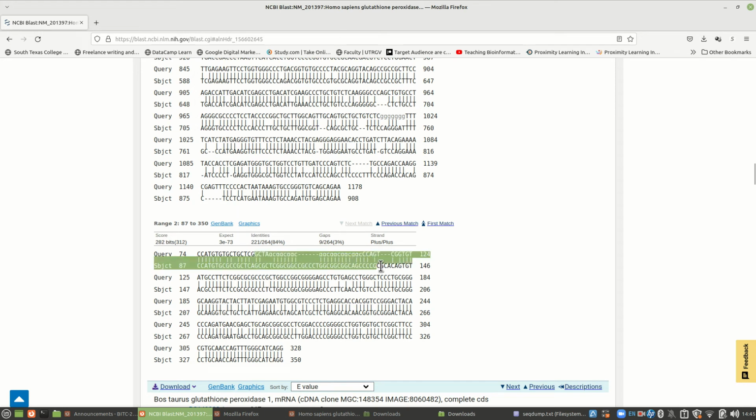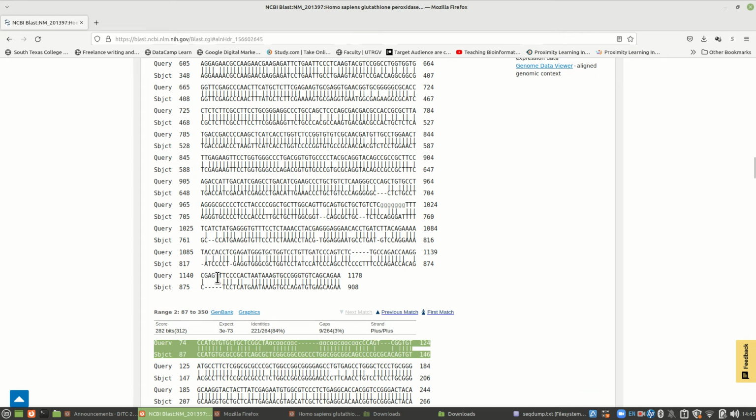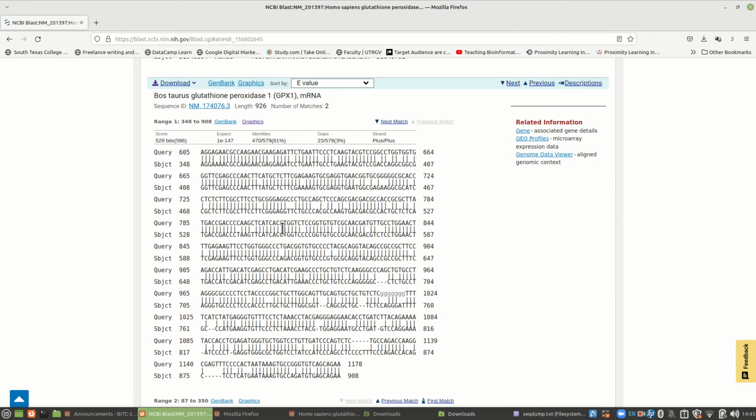You would notice these. If you want to, you can copy this piece and put it into your report, and then talk about this whole piece, because this is the interesting piece right here. And this one, there might be a couple of interesting pieces here, and both here and here. Here are some mismatches, things that don't go together, don't align. Let's see, some interesting things.